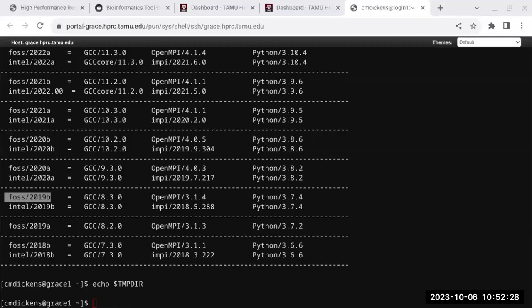All right, digital normalization. BBMap, I think, is a really useful tool. They have a lot of different subtools available. You can do digital normalization. There's error correction. There's overlap correction. Remember I showed you how the pairs are overlapping when you sequence? BBMap has a tool within there that can find these sections and do error correction.